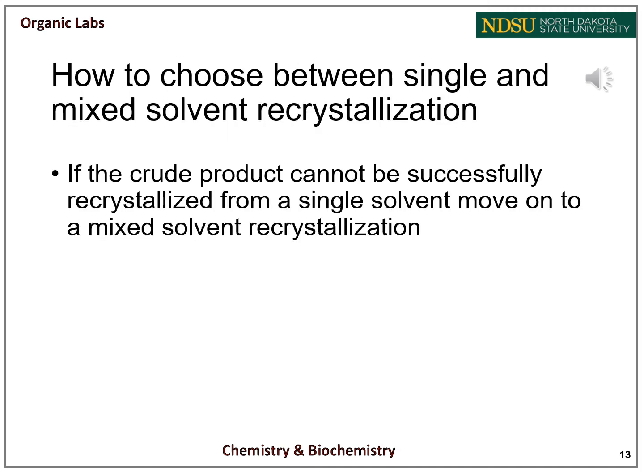And so you may be wondering how to choose between a single solvent recrystallization and multi-solvent recrystallization. And it's pretty simple. If the crude product can't be successfully recrystallized from a single solvent, it's time to move on to a mixed solvent recrystallization.